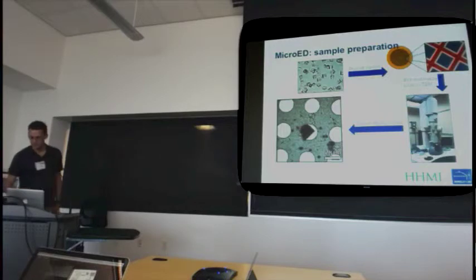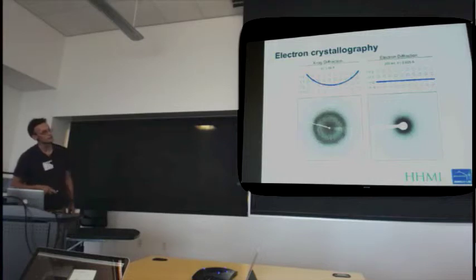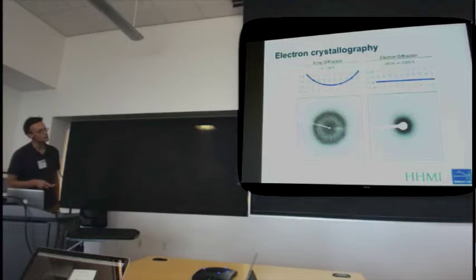Now, one big difference, and this is something that often comes up when talking to crystallographers about these things, is that the wavelengths we're looking at with electron crystallography are a lot shorter than the wavelengths we would be seeing with X-rays. So that's shown here. There's the lysozyme diffraction image again, collected on a home source. So a cartoon of the lattice, and then the Ewald sphere, and where the Ewald sphere intersects the lattice, that gives you the spots that are in the diffraction condition, which you then record on the image.